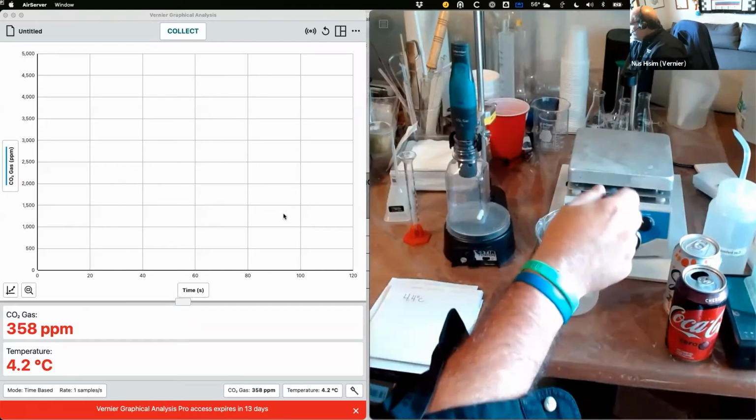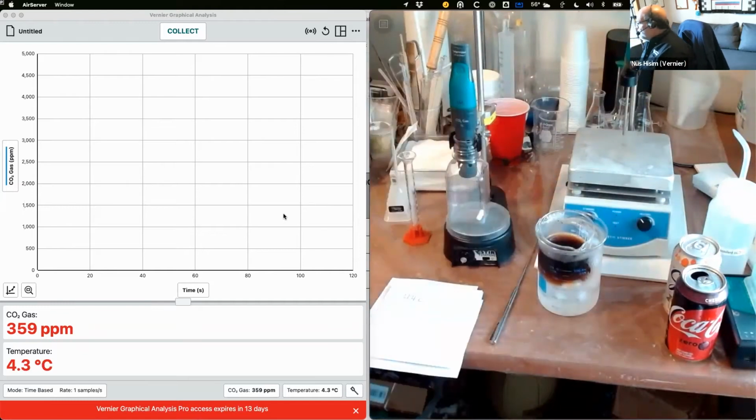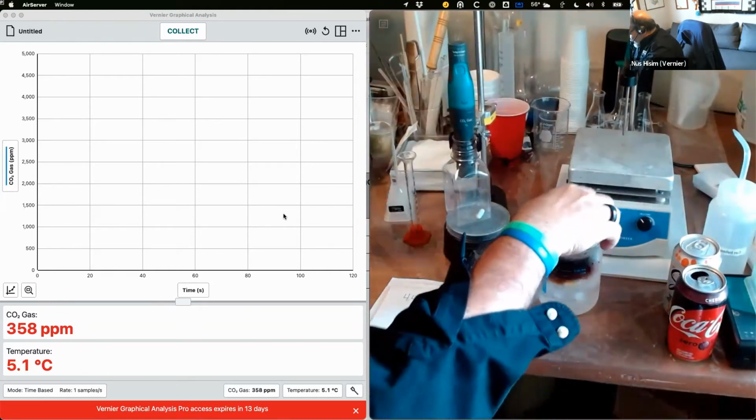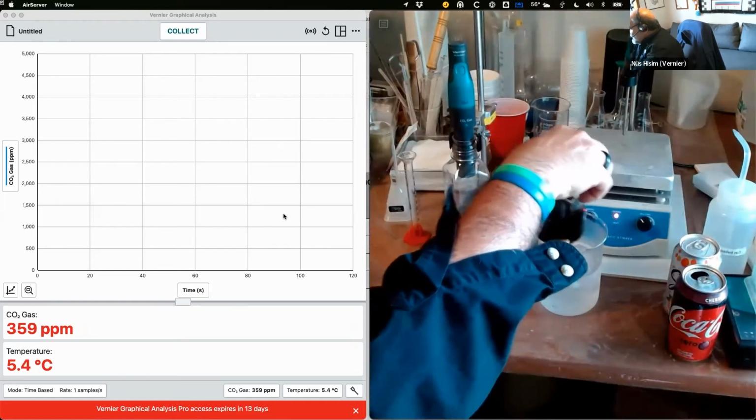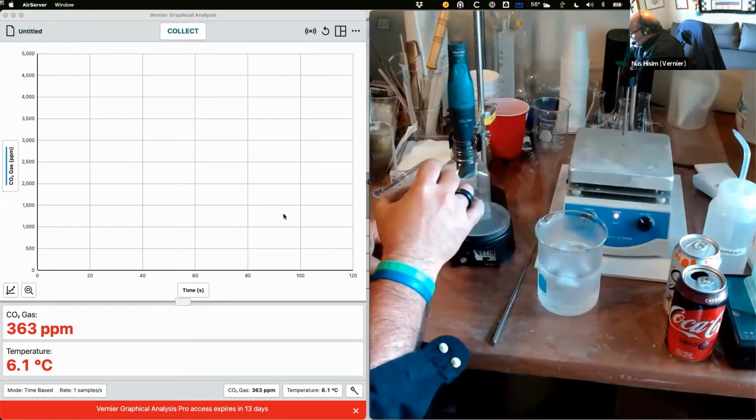I'm going to be heating up the solution there on the hot plate, so let me flip that on. All right, so let's get going. The lab says to take 5 milliliters of solution.